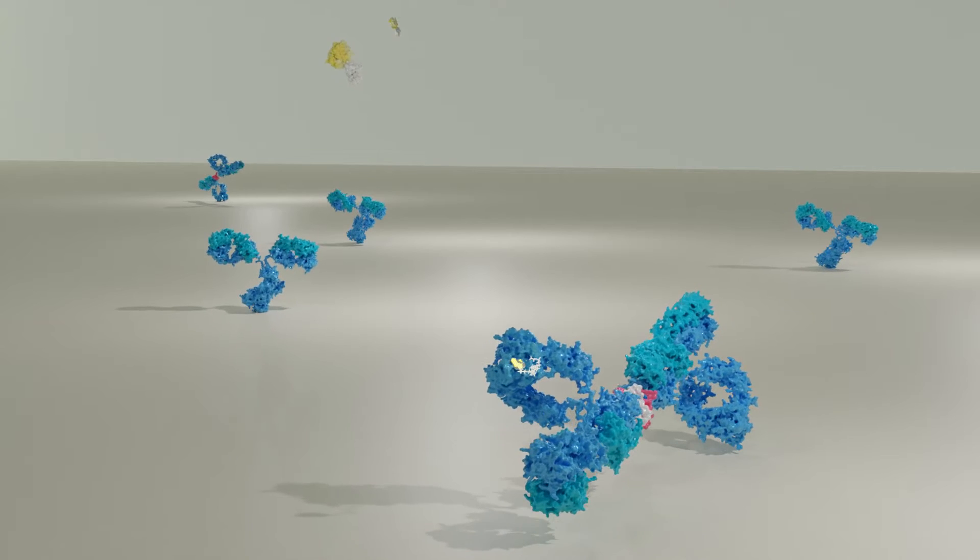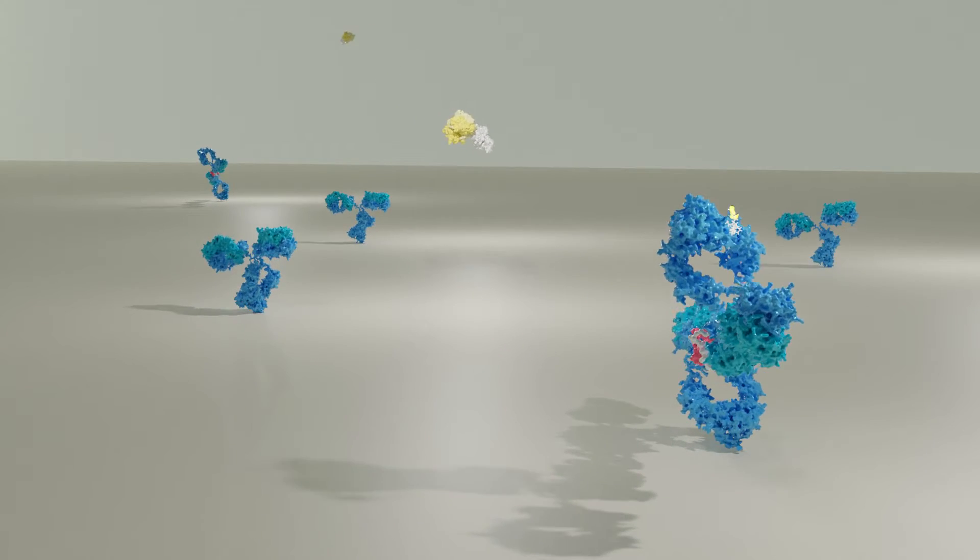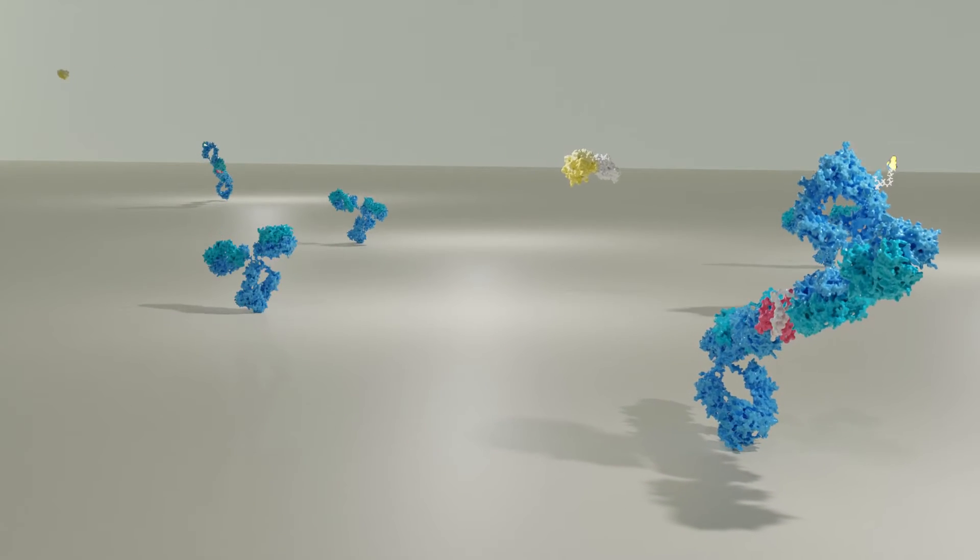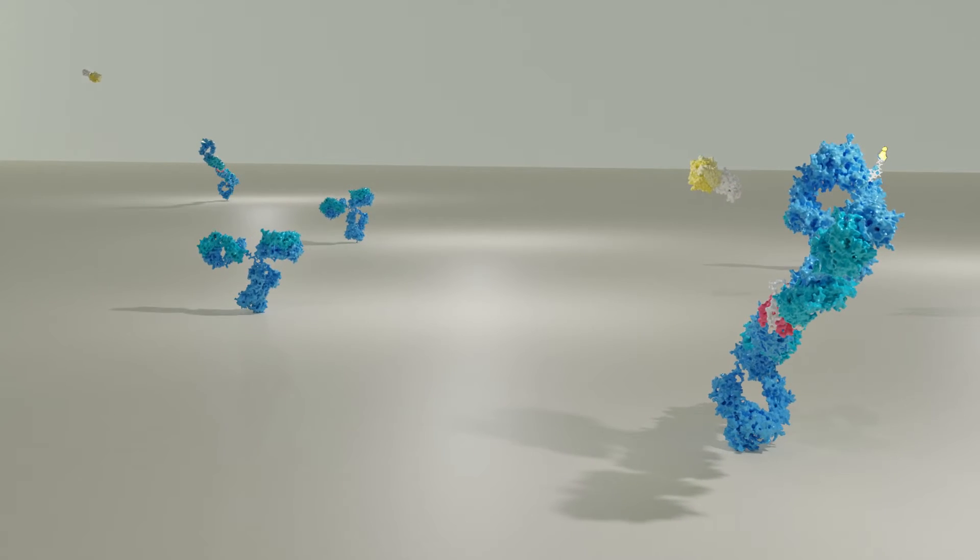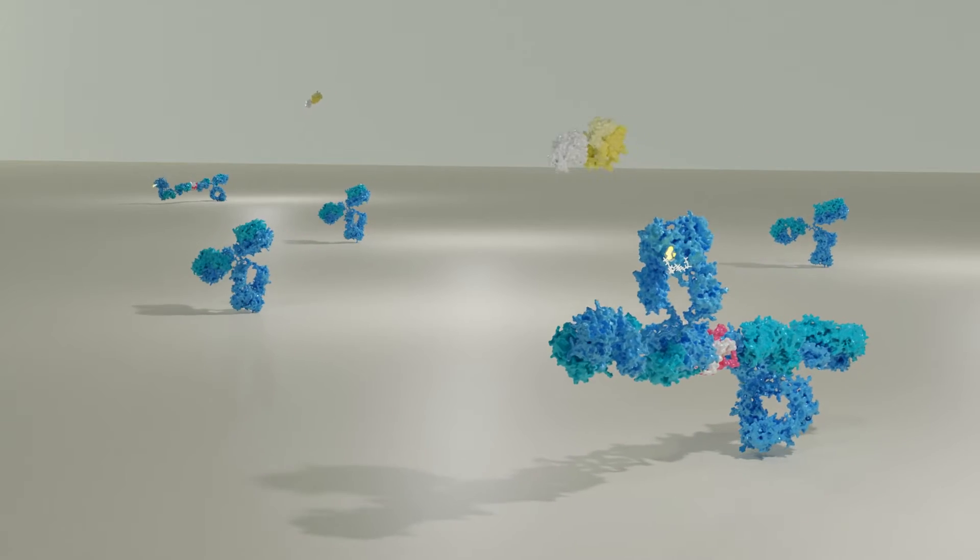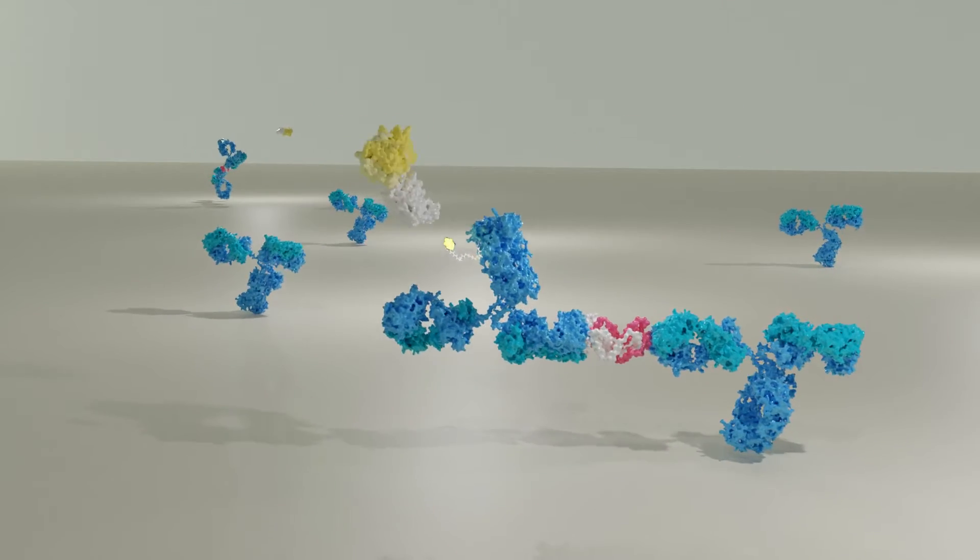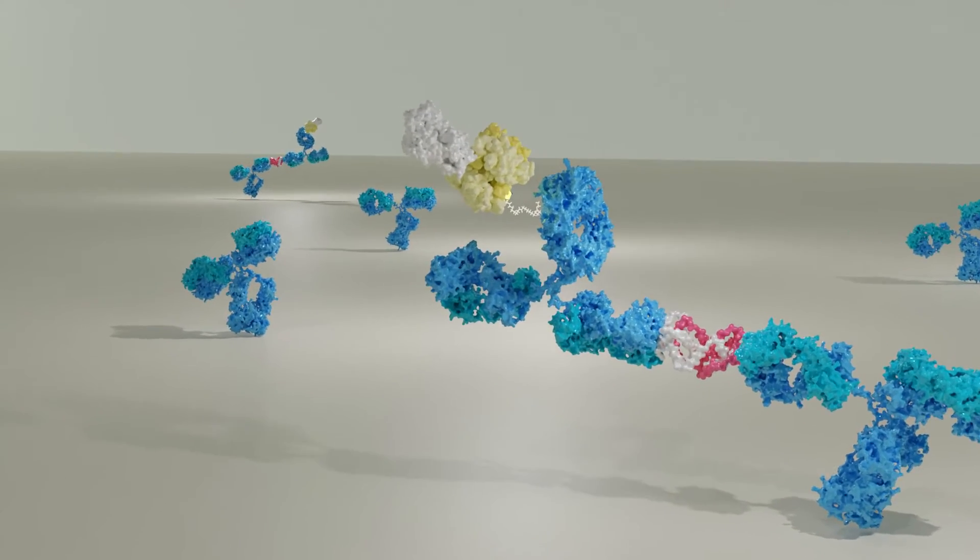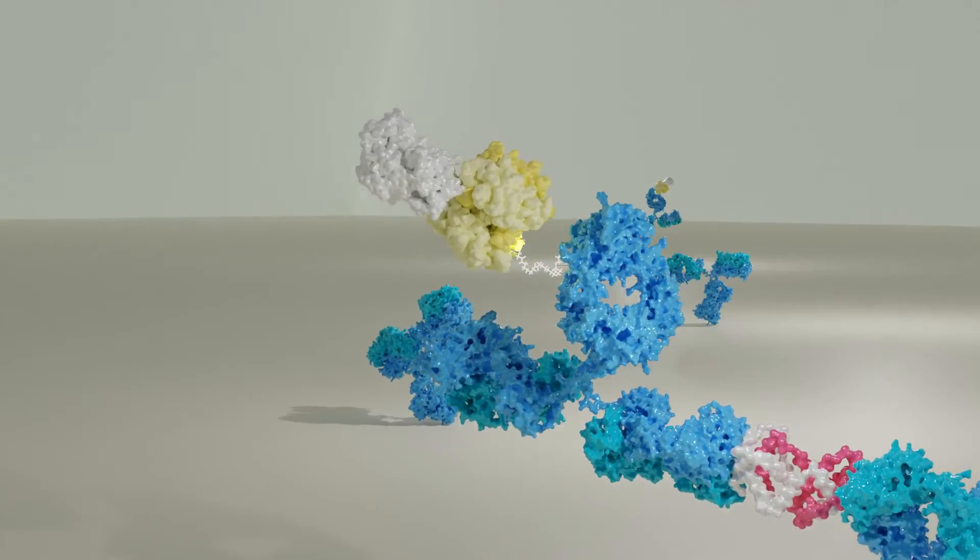After washing, we add streptavidin linked to horse radish peroxidase. Streptavidin will bind biotin, and in this way the enzyme horse radish peroxidase will be present bound to the well in an amount that is proportional to the amount of gamma interferon present in the sample.